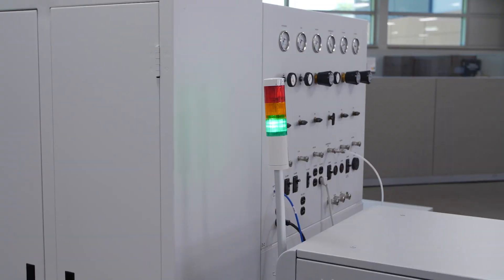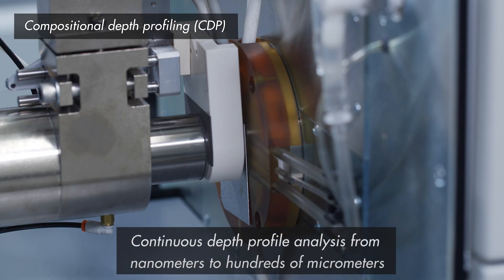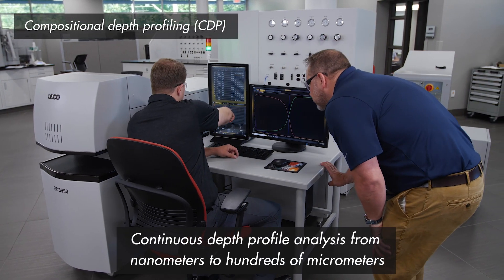The GDS 950 takes Glow Discharge a layer further with Compositional Depth Profiling or CDP. The shallow burn spot and fast sputtering rate allows a continuous depth profile analysis from nanometers to hundreds of micrometers.